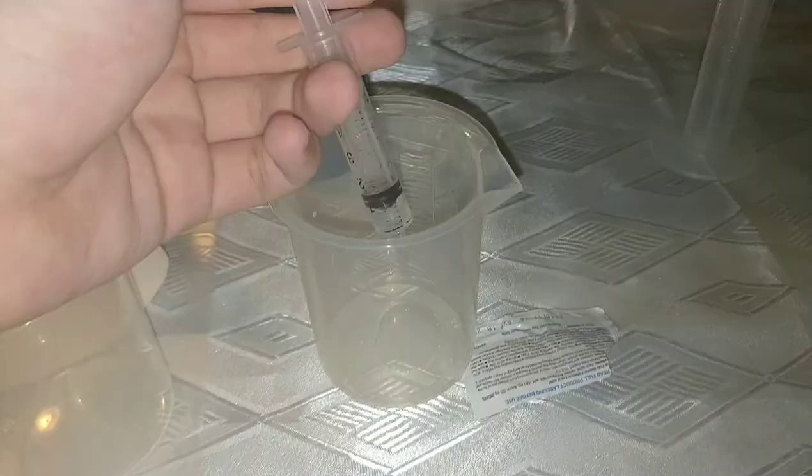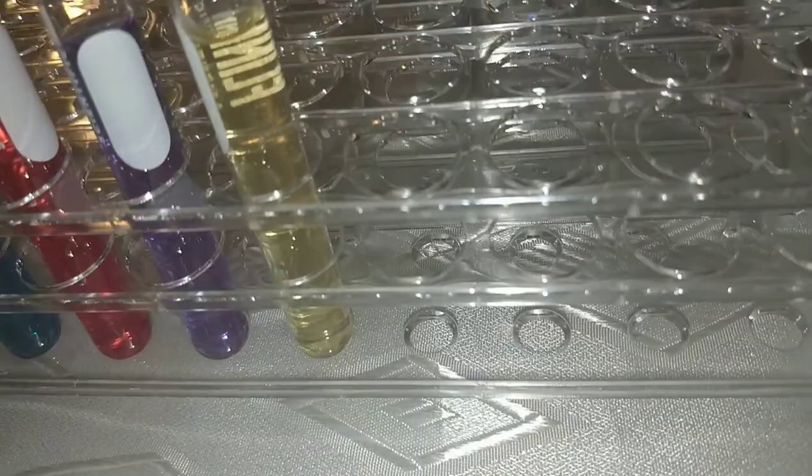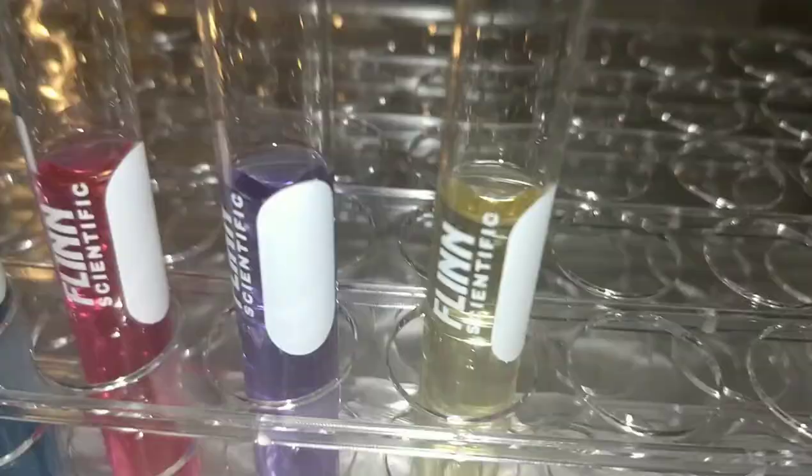Next I'll test the bleach. Not surprisingly, the bleach turned completely blank or yellow. But we know from our other tests that bleach is extremely basic — it's bleach, so it made it white, but it is basic. We'll mark it down as white or yellow.